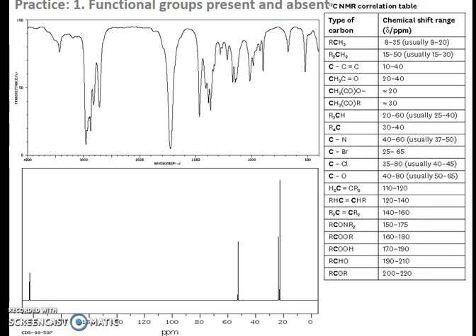Now if we then jump down to the NMR spectrum, there are three things that are quite useful here. The first one is that there are four peaks, which means that there are four unique carbon environments. One of those peaks is up just over 200 ppm, about 205 ppm, and that is indicative of either an aldehyde or a ketone.